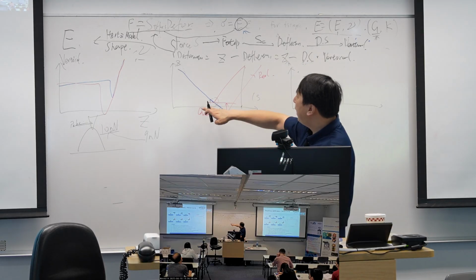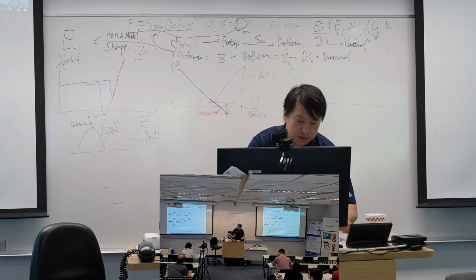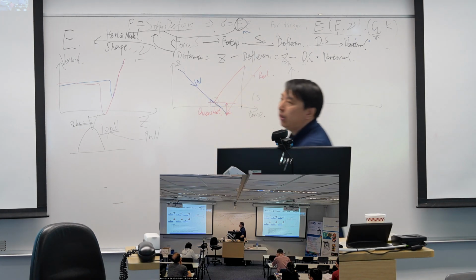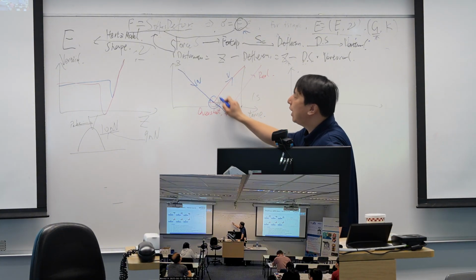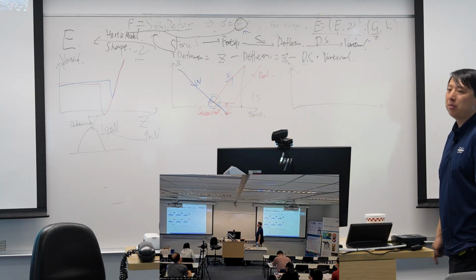So when we go back to the force curve, we realize the problem came out here. We have a velocity up, down, we have a velocity up, and then we have a large acceleration at this point. So that's the problem here.